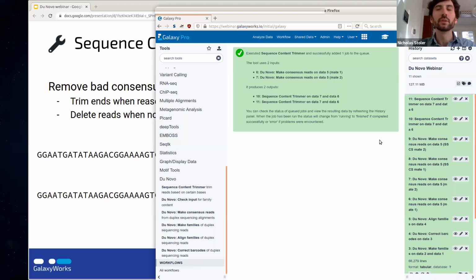And you can pretty much use them just like you would regular reads, except if you're doing variant calling, you can perhaps change your thresholds, because even if you see a variant in a couple of these consensus sequences, you might have something real there, because these are consensus of several reads on each strand, very reliable reads. So it's a pretty useful method.